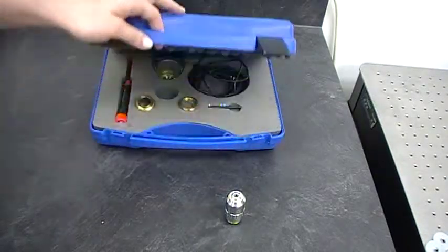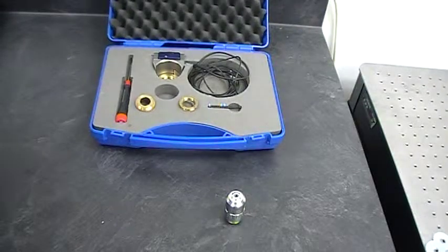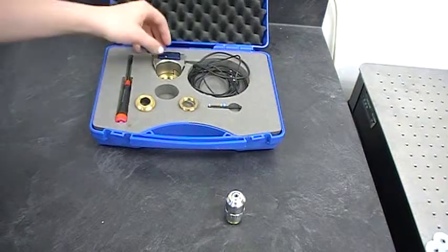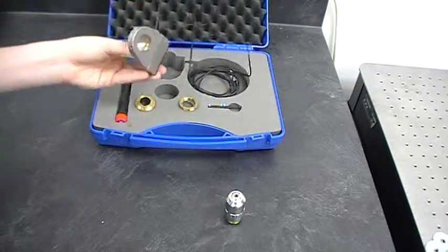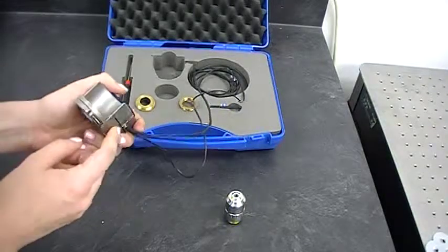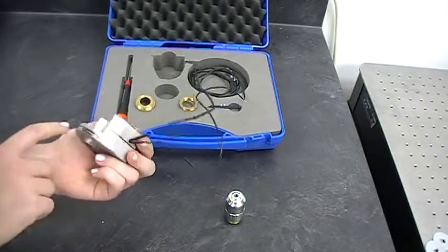The MIPOS comes in a case like this. It has all the tools you need contained. Here we've got the MIPOS stage itself, with the moving element being right here.